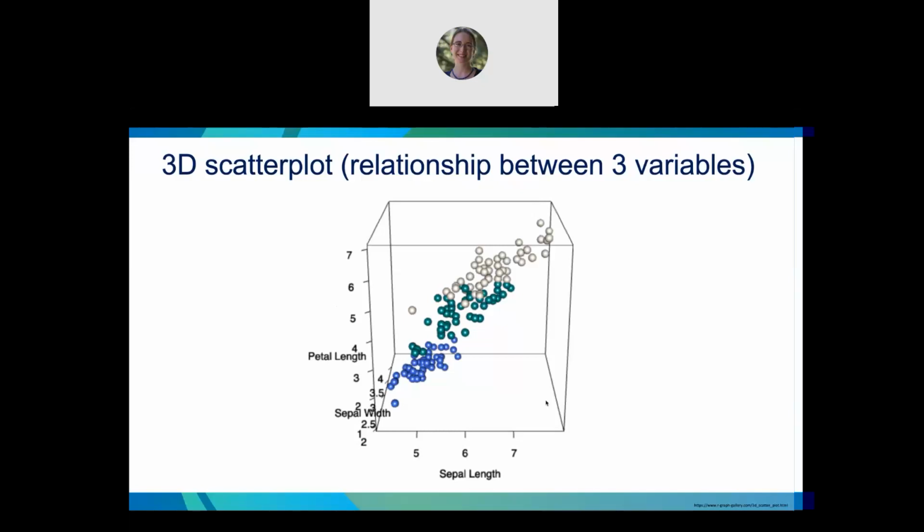Depends on what we're trying to show with the comparison, correct? More variables on one graph isn't necessarily better. Right, right. That's true. Movies with multiple screens, good. Time can only take care of one dimension. That's true.